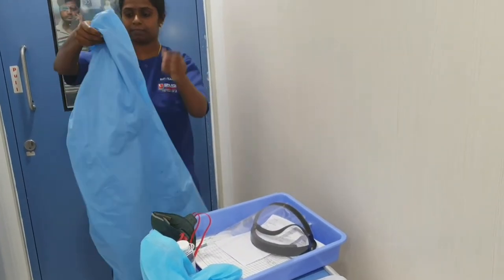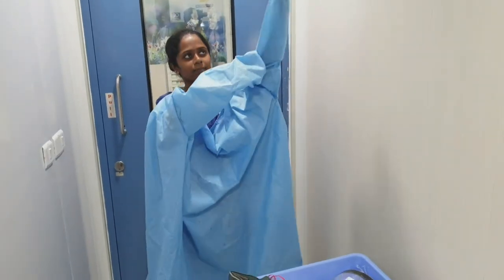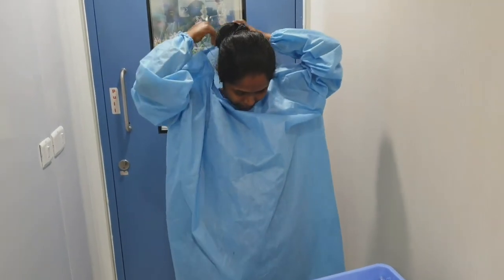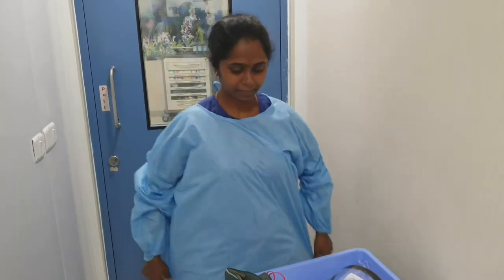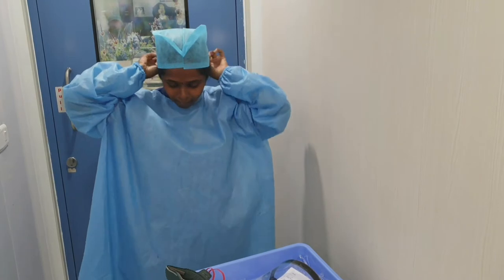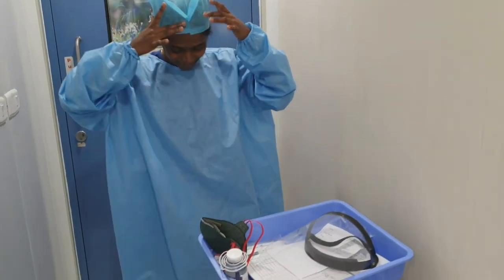This is a full-sleeved gown which is covering till your wrist. This is a full-sleeved gown and she is bare below elbows. She is wearing the crocs which are to protect her feet.